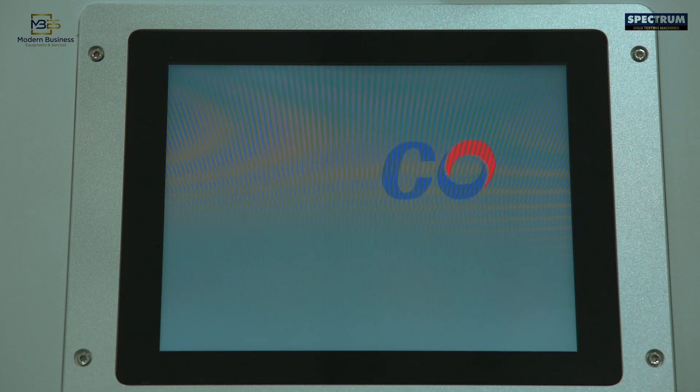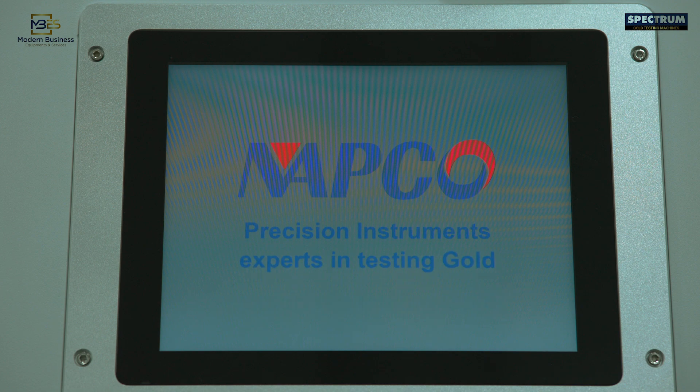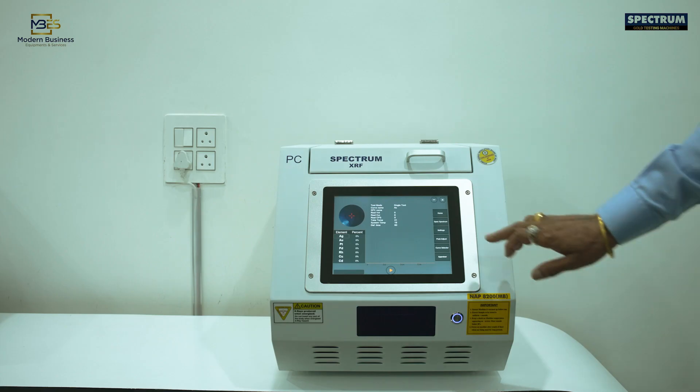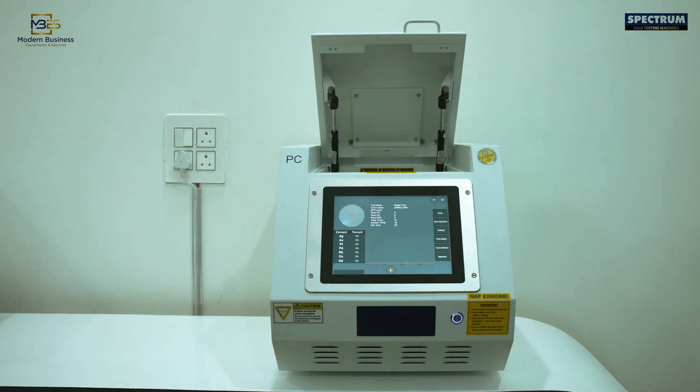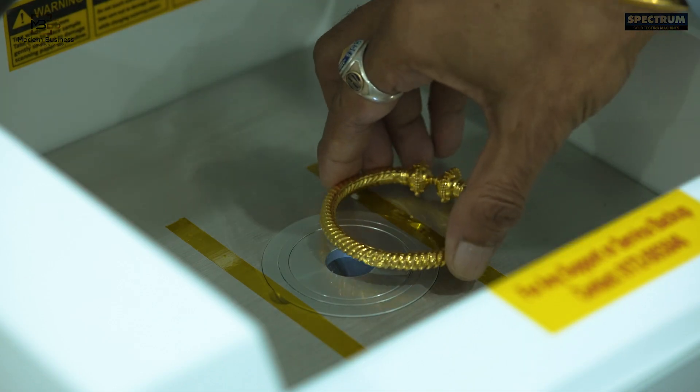Low electricity consumption, no wear and tear. It can quickly test gold jewellery as well as melted gold placed on its 20mm scanning area in just 30 seconds, with a printout.